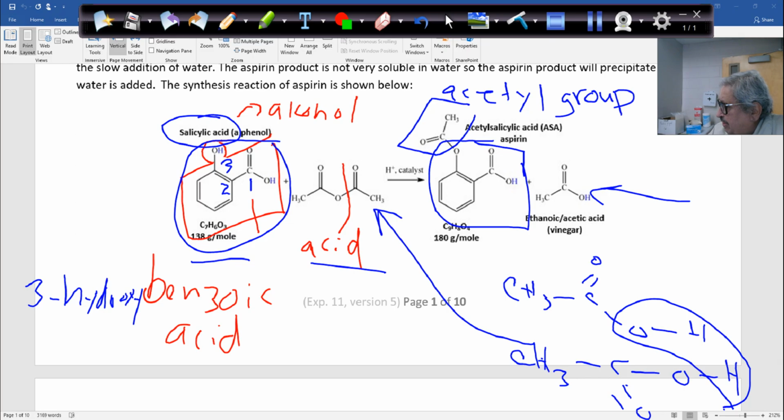The commercial name of it is called aspirin. But the real name is acetyl salicylic acid. So today in the experiment, we'll have the opportunity to synthesize, to make aspirin. It's a very good medicine to cool down the brain if you have a headache or you have fever or whatever. Aspirin is good for these purposes.